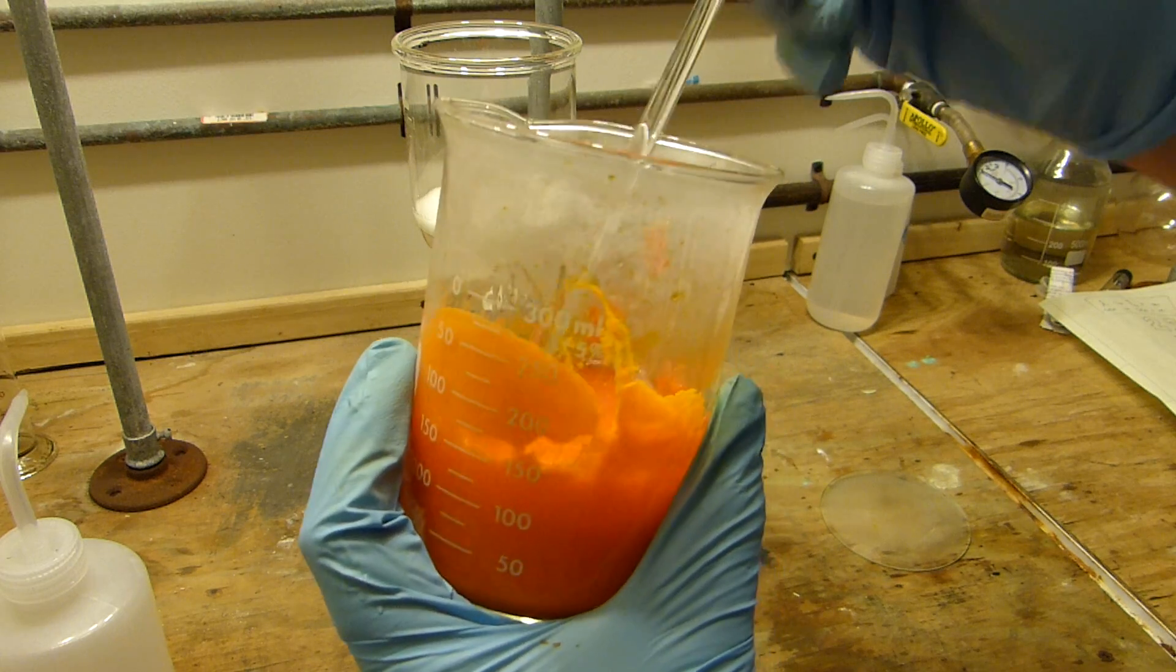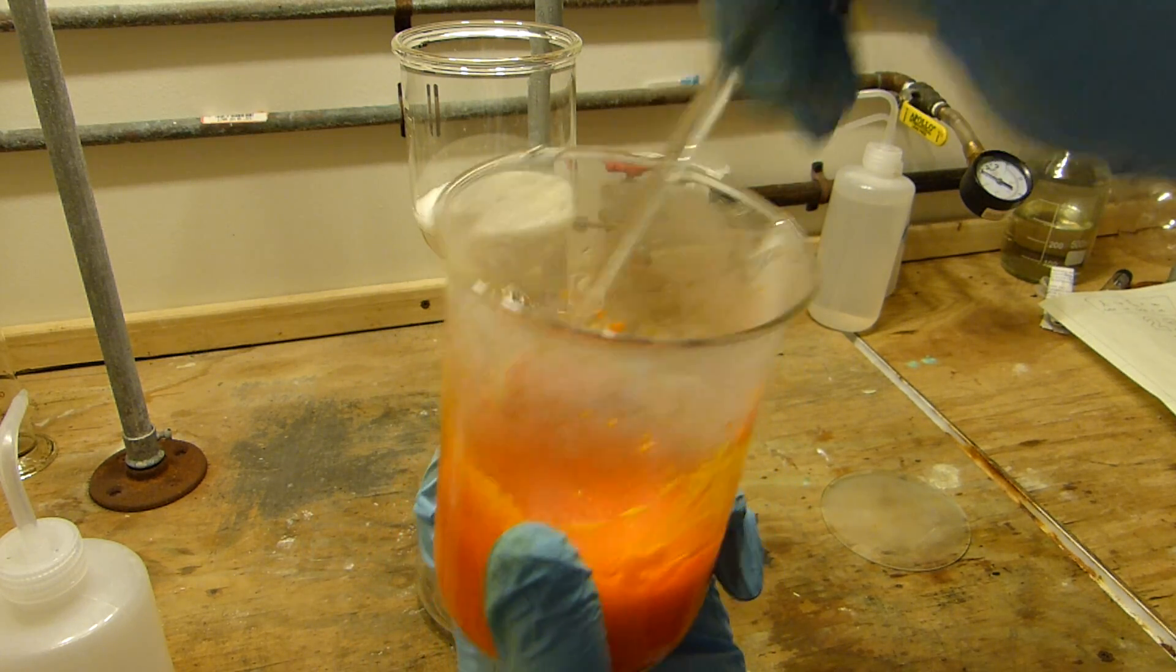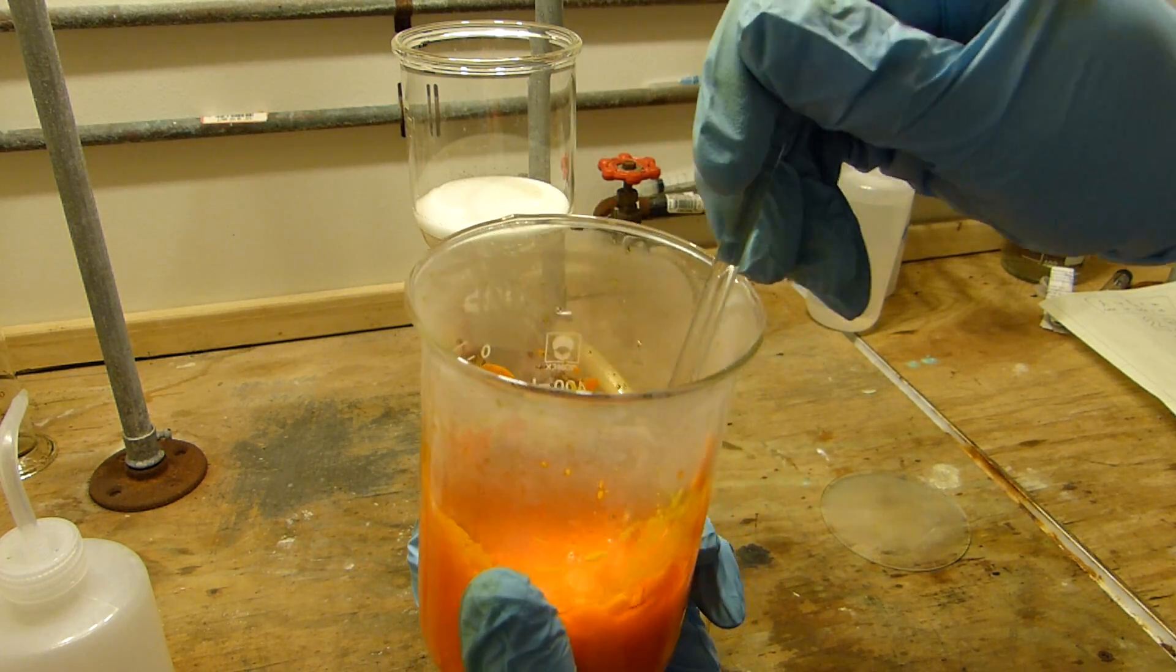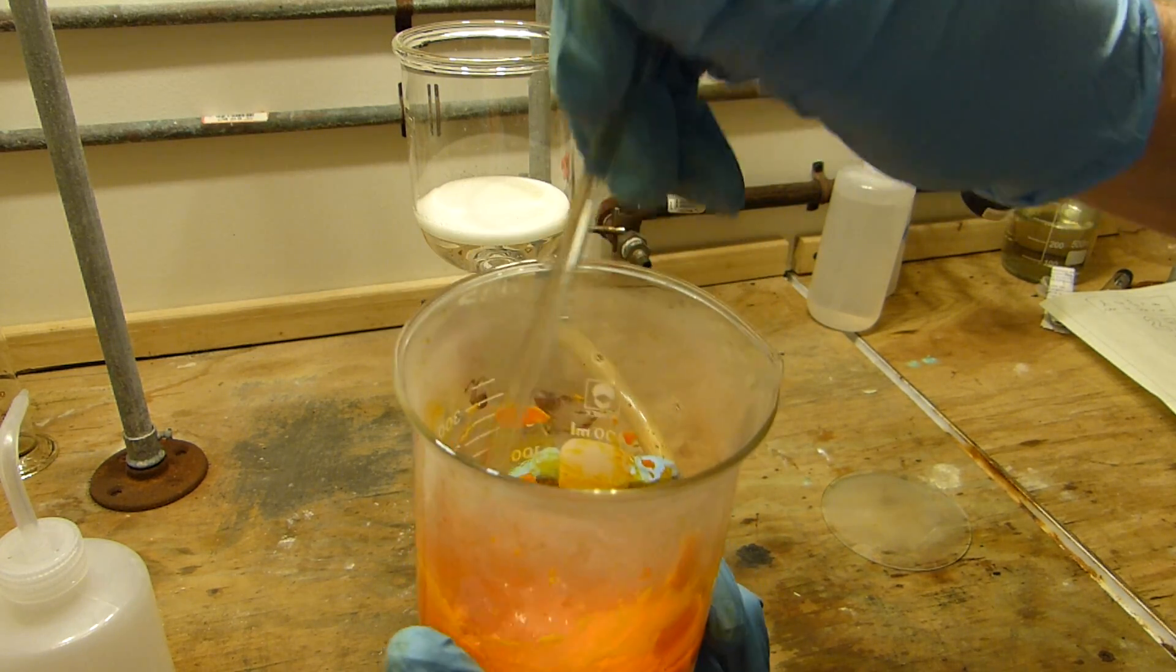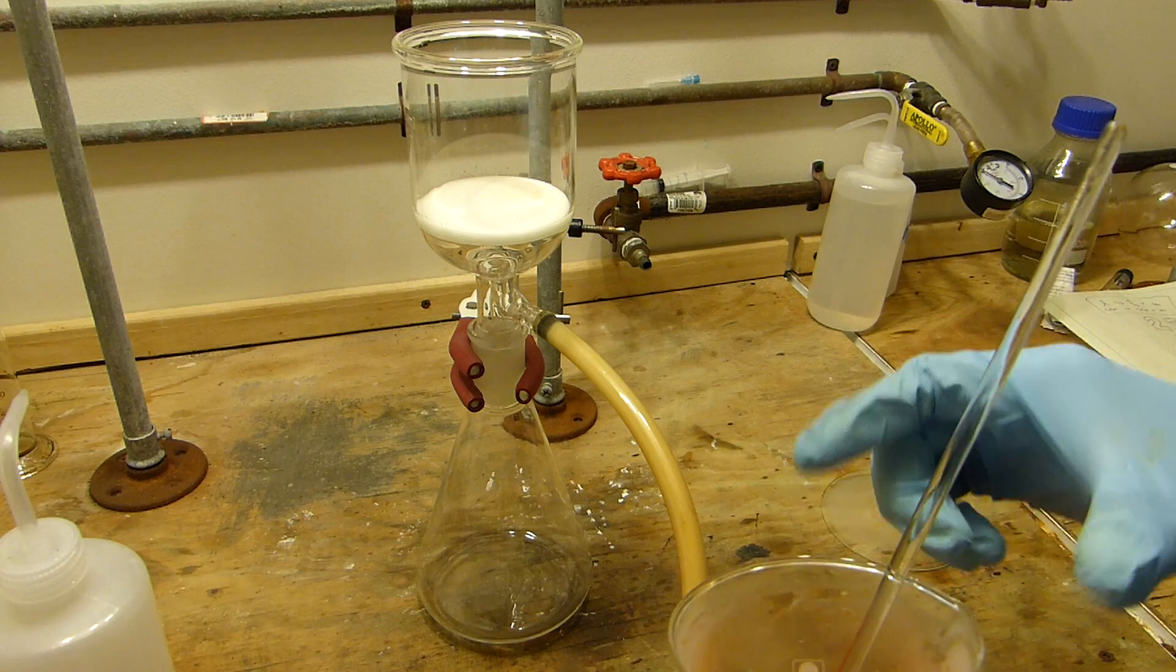I'm just going to try and break up as much of the chunks as I can. They sort of formed on the sides and stuff. I think it was starting to freeze a little. So as soon as the chunks are broken up then I'm going to go ahead and vacuum filter.